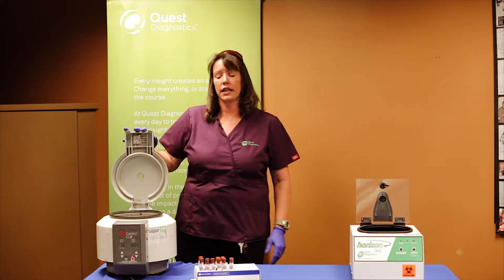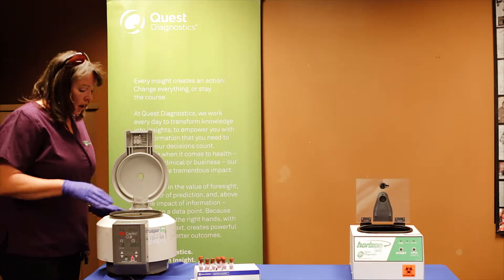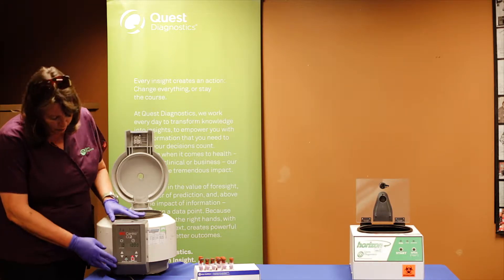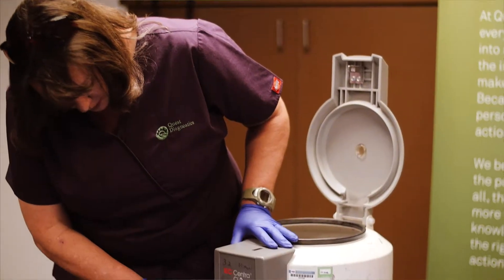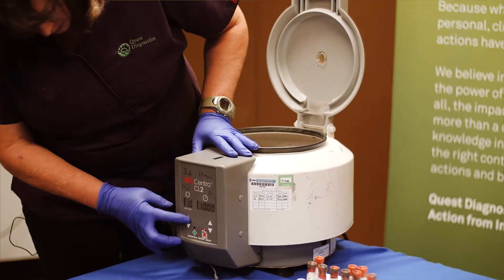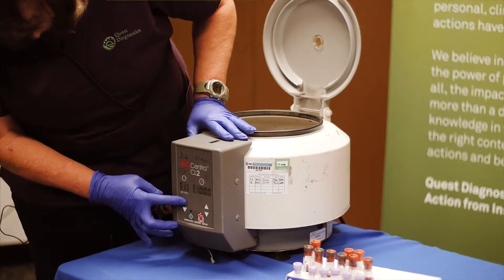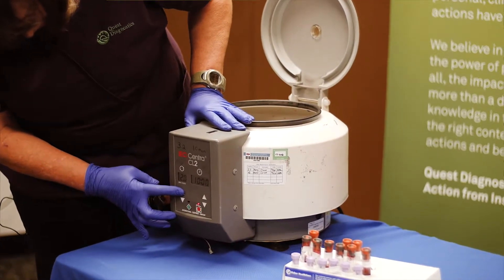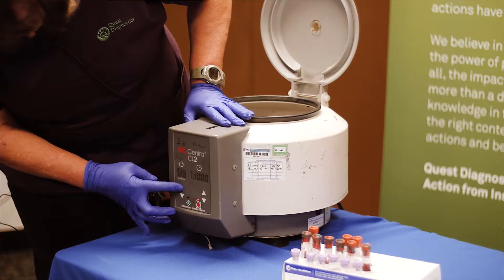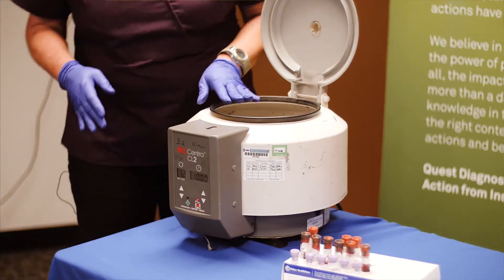The reason I have this one here today is because when we send these out to the statewide sites, we need to make sure that these are set up properly when they are plugged in. When you plug them in, they are automatically set at 0.1, and you must push the button to set them up to 3.2 in order for this to spin at the correct RPMs. The time has already been automatically set for you at 10 minutes, so you do not have to worry about that.